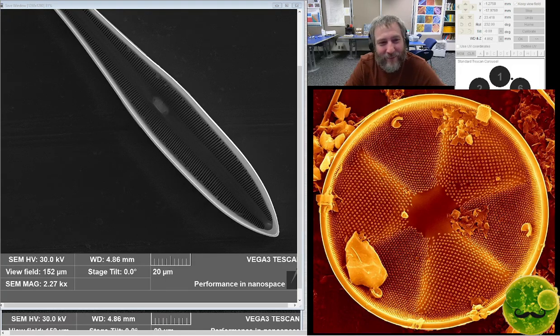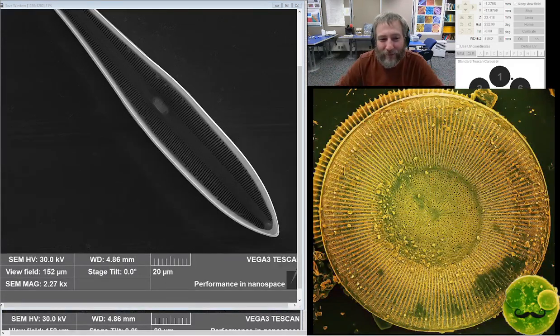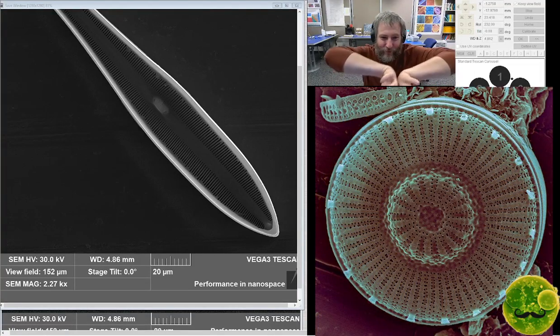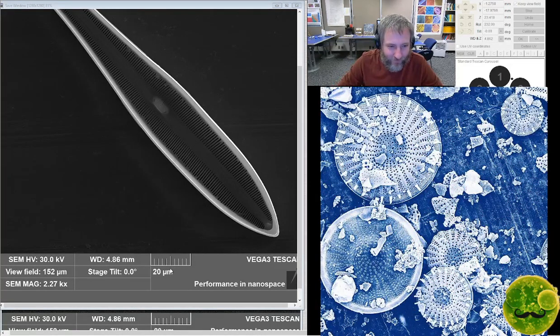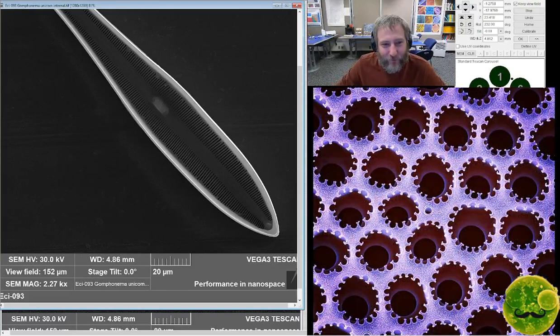Could it be a scar from the split? No, they don't have scars. The diatom is already split in two. It's got like a little bit of chintzy duct tape kind of structure around the outside. And when it splits, these rigid parts just stay rigid. And a new part grew on the inside before they split apart. So for each valve, it already formed the other half of what would be its final skeleton for the next generation, inside, so facing the opposite direction. So then when they split apart, they just take half. Yeah, that looks like a throwing knife to me. It's definitely not a scar though, and it doesn't occur in every diatom, so that's another issue that defeats that idea. It only occurs in a subset of diatom genera.